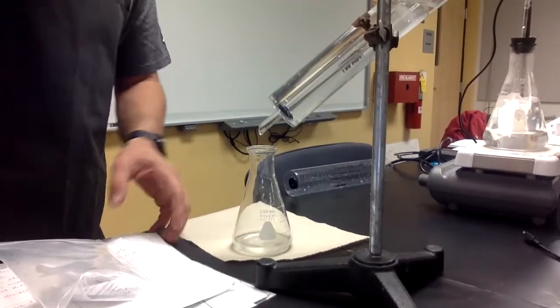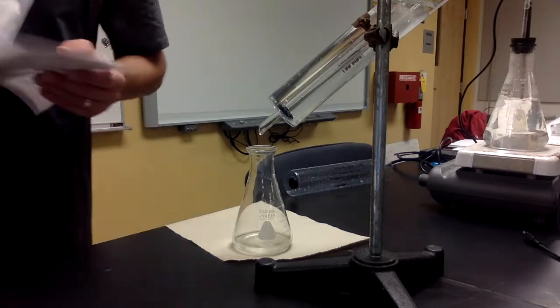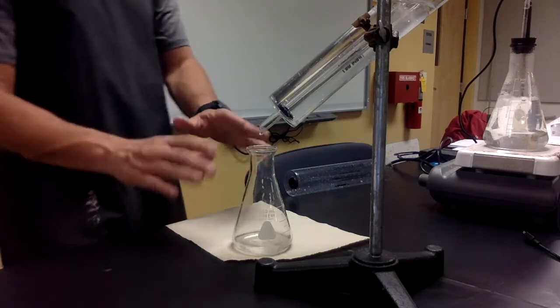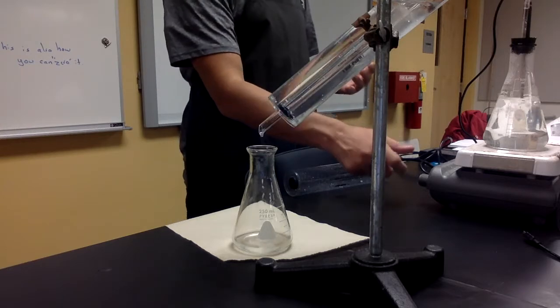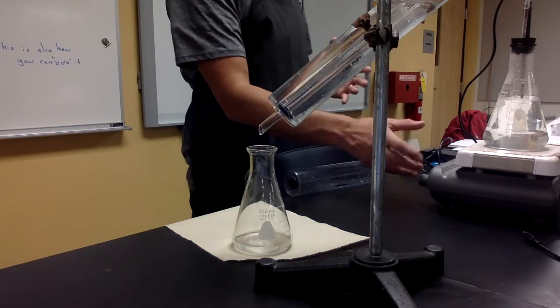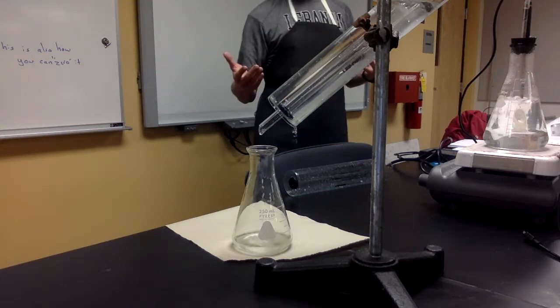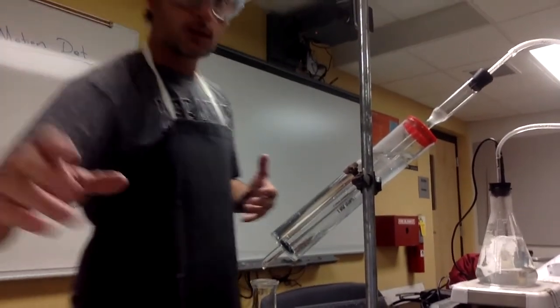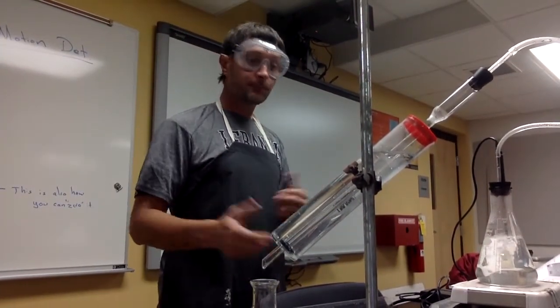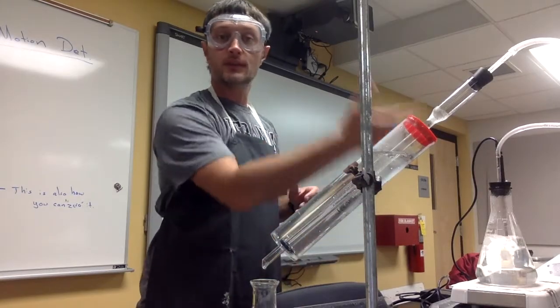Down here we've got our liquid reforming, and this is pure. I know that this is a pure liquid because I've made sure that only one thing is boiling. Unless they both have the same boiling point, then I may have a mixture. But since I've been careful and I've gone slowly, I should be confident that only the first substance is bubbling through.